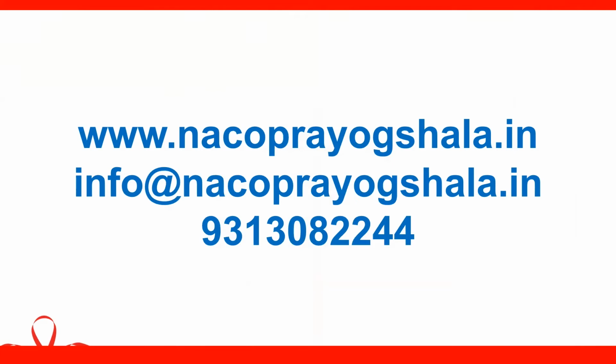It also has multiple device compatibility. You can use your desktop, laptop, even a tab or a mobile. But we always prefer desktop or laptop because the screen size is very small on a mobile smartphone, so many mistakes happen. Once you are entering the last data, maybe the first data was not visible on the screen. So try to monitor and submit data, especially at data submission time. Monitoring is not an issue anywhere, but for data submission, you have to use a desktop or a laptop, and that is preferred. So now the slide presentations are finishing.